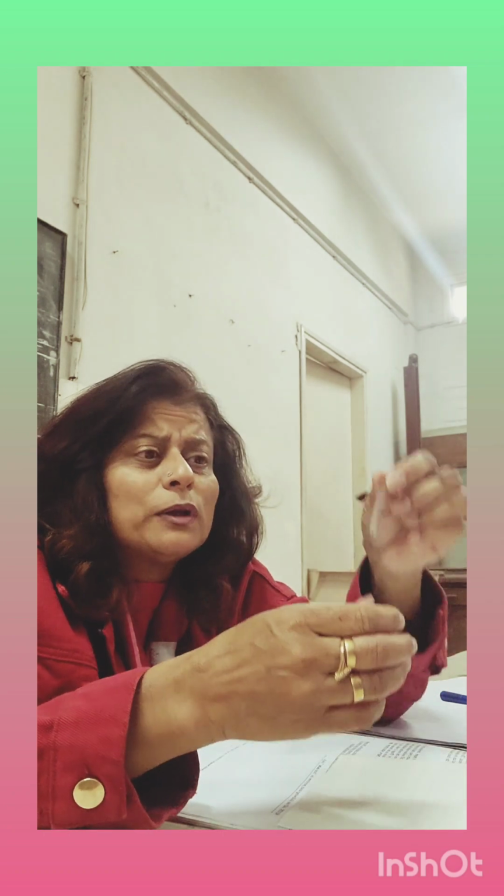Fine. So now, if you jump to your preparation, they are saying dry a small piece of sodium metal between the folds of the filter paper. Now you have a sodium metal lying inside. Now, Mr. Irfan, our lab assistant, is going to give you. It should be the size of a pea, matar ke dane jitna, not more than that, because just look at the size of this. You have to introduce that sodium metal inside this, so it has to be very small in size, right?